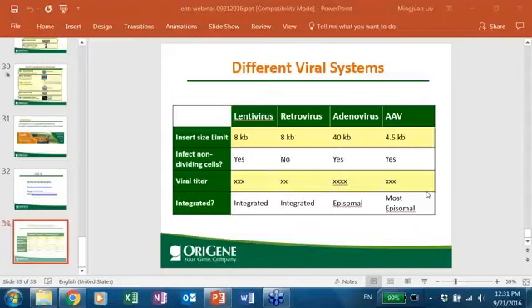One question I believe is, how do you usually measure MOI for a batch of viral production? I think it could mean, how do you measure viral titer for a batch of viral production? There are different ways. Sometimes they use P24 ELISA kits, and sometimes people use PCR, or they infect cells to just calculate the colonies. There are different ways to do that.